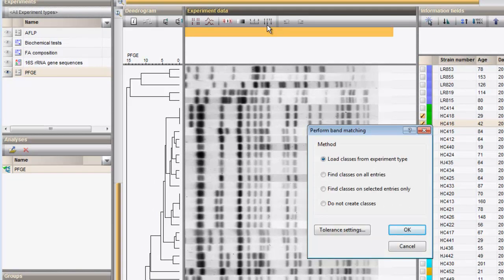However, without performing an actual global band matching since we have clustered the patterns based on pairwise distances. So I check the option to not create classes.